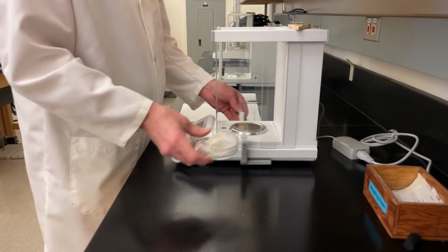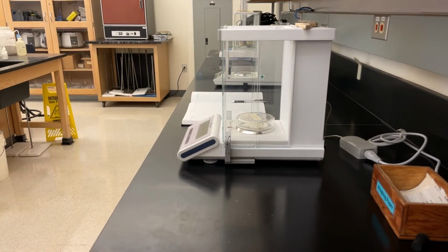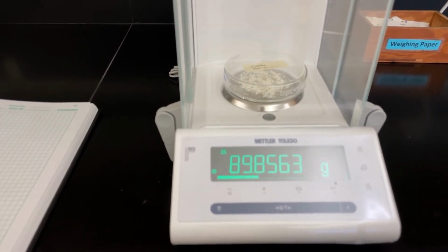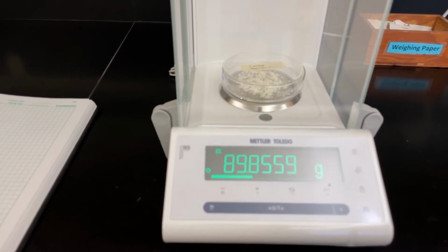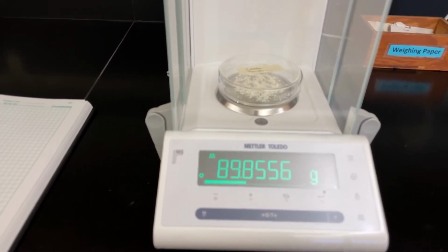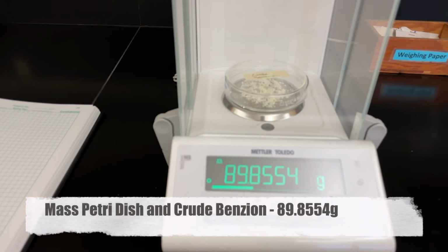Okay, just a quick weighing here. Get our crude benzoin on the balance. Let's see what we've got. 89.85 and falling. It might continue to fall too because of the water that's in it. This is just supposed to be a rough weight. There we go, let's call it 89.8554.